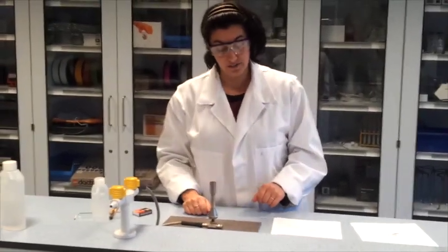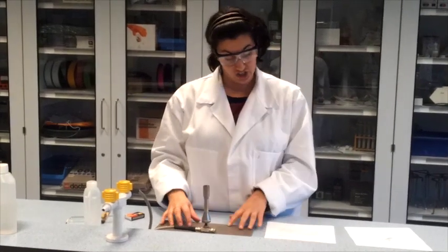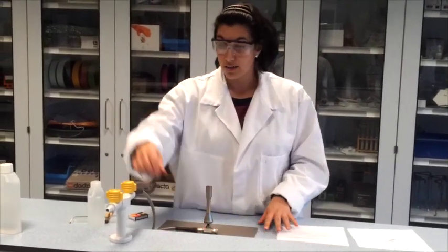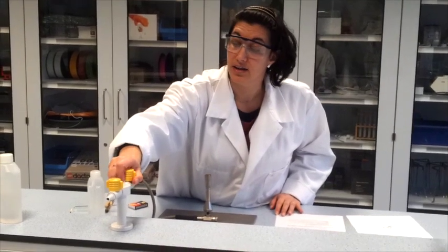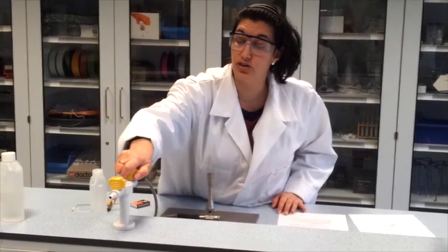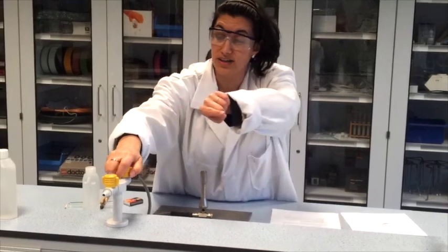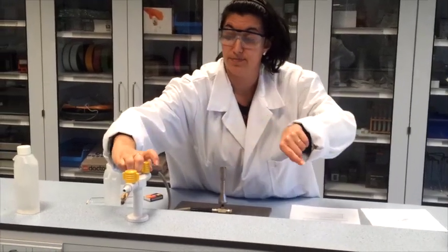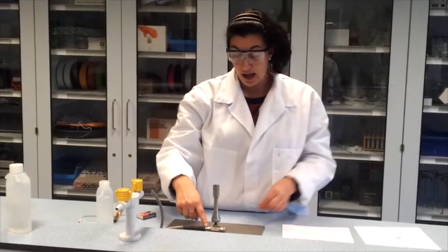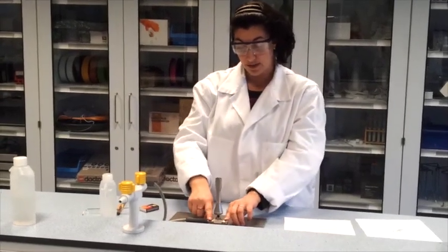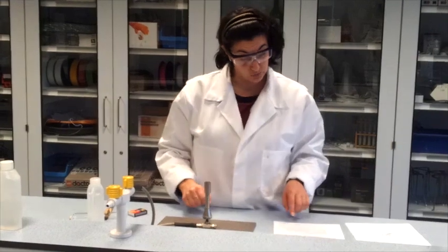Place the Bunsen burner in the middle of the table, not too near to the edge. Then we open the gas tap. We do that by pulling the knob upwards and turning counter-clockwise which is to the left. Now the gas streams through the rubber tubing up to this point. It can't go further because the knob is closed.